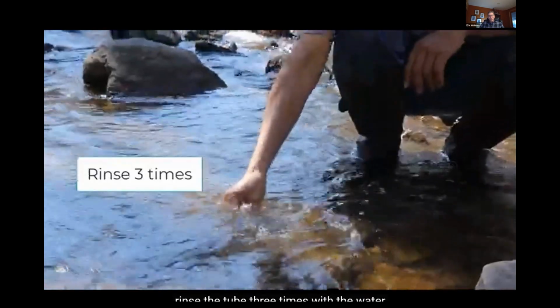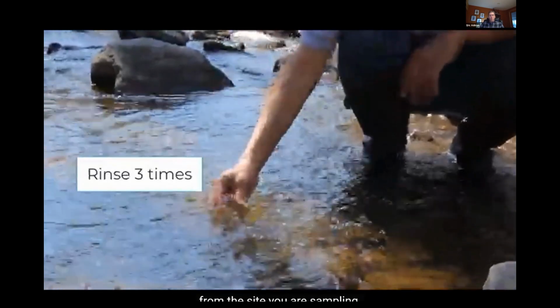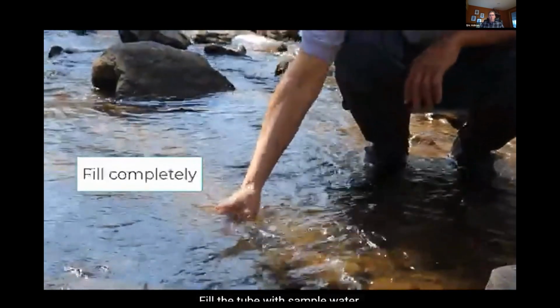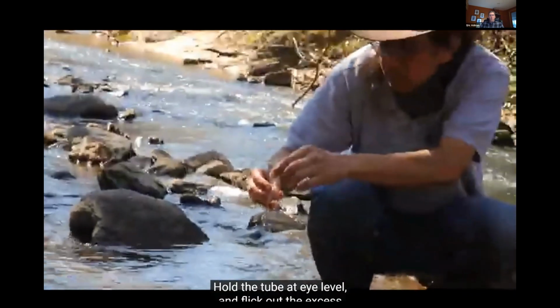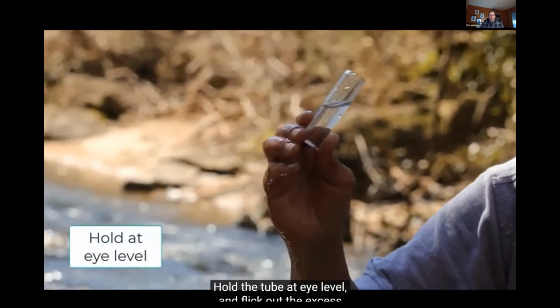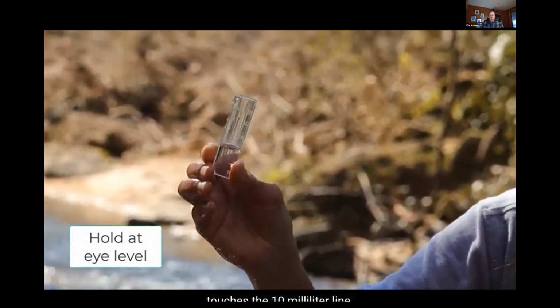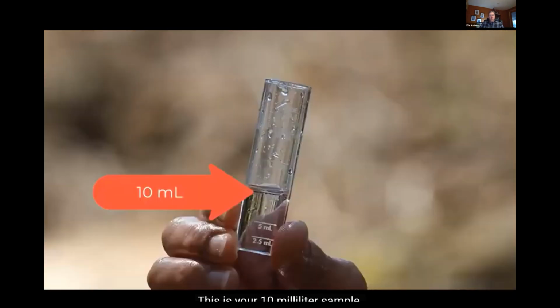Remove the alkalinity test tube from your kit. Rinse the tube 3 times with the water from the site you are sampling. Fill the tube with sample water. Hold the tube at eye level and flick out the excess sample water until the bottom of the meniscus touches the 10 milliliter line. This is your 10 milliliter sample.